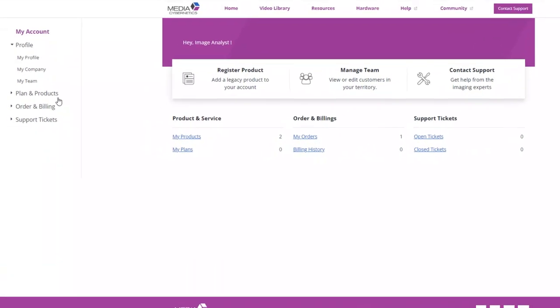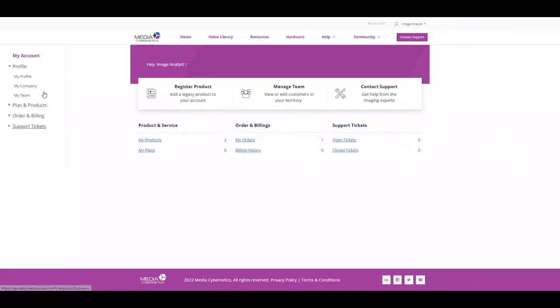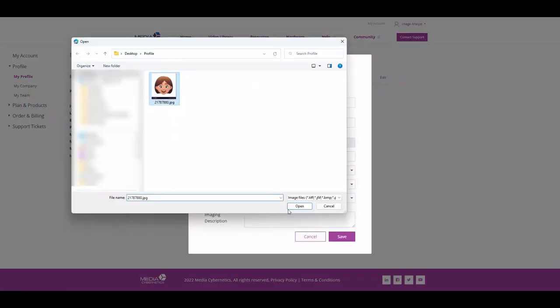Expand the Profile dropdown on the left and click on the My Profile link. You can then complete your profile.